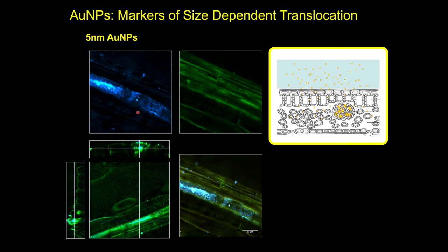give us a plasmon resonance at the wavelengths that we're exciting at, around 1 micron. So where we have isolated particles in the solution surrounding the roots or within the roots themselves, we don't see any ESA signal. It's only where the particles become aggregated and form clusters that the surface plasmon resonance shifts to our excitation frequency. This works very nicely because it allows us to apply small particles that can diffuse through the plant cell walls and show us where they're aggregating within the vasculature in the plant root. In this case, we're looking at the phloem or xylem within the plant leaf.